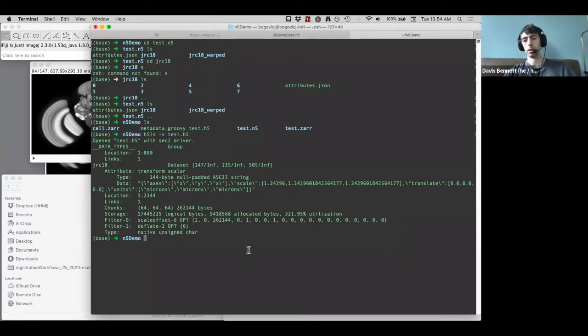Metadata for arrays or datasets should live with the array or the dataset instead of putting everything up at the group. The real consequence is that when you're opening data, you're opening an array. You might use the group to find where the array is, but you're going to open an array, and you want the metadata to be right there with it. You're going to copy arrays, you're going to delete arrays. The metadata should be right there so that when you copy and delete, the metadata moves too. But this wasn't something that was actively discussed prior to the latest spec. I only noticed it after the spec was written, so it's possible that there was just some miscommunication.